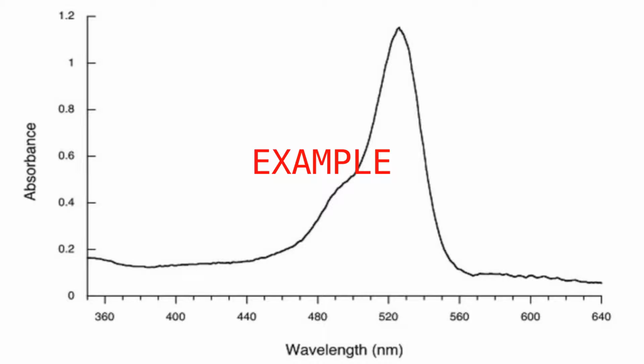When using a spectrophotometer, it is important to scan across all wavelengths to determine what range of wavelengths the sample actually absorbs at, as well as the peak absorbance of the sample. Scanning across all wavelengths will generate data that can be graphed with absorbance on the y-axis and wavelength on the x-axis. While scanning across all wavelengths, the sample will absorb some wavelengths better than others. The result will be a continuous plot that has a defined peak at some wavelength lambda. This defined peak is referred to as lambda max because it is the wavelength of light that the sample absorbs the most.